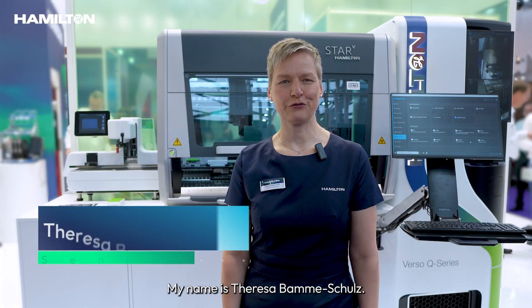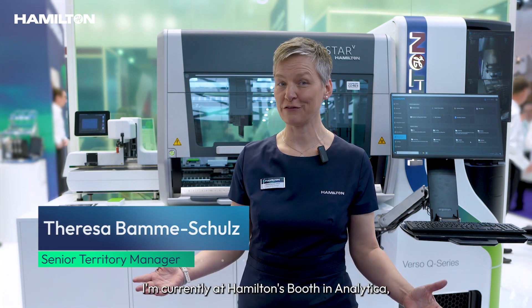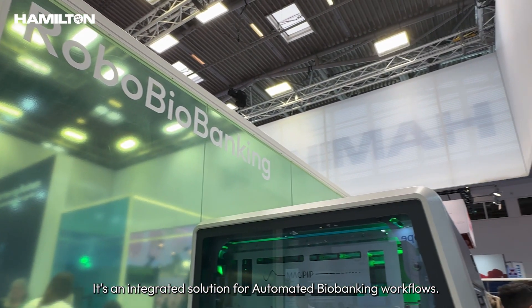Hello, my name is Theresa Bamme-Schulz and I'm Senior Territory Manager at Hamilton. I'm currently at Hamilton's booth in Analytica and I'd like to introduce you to the system behind me. It's an integrated solution for automated biobanking workflows.